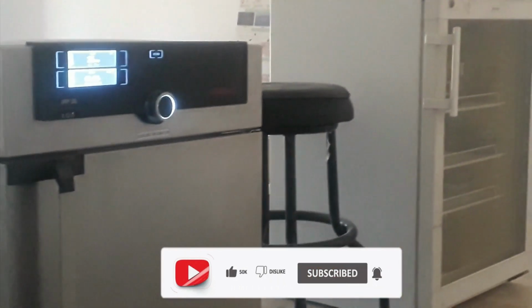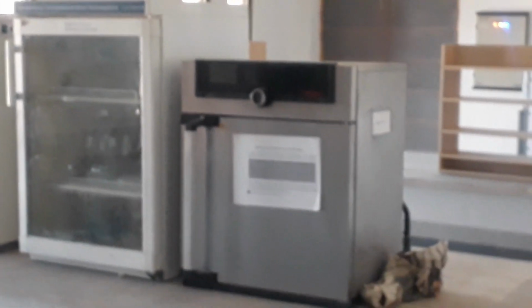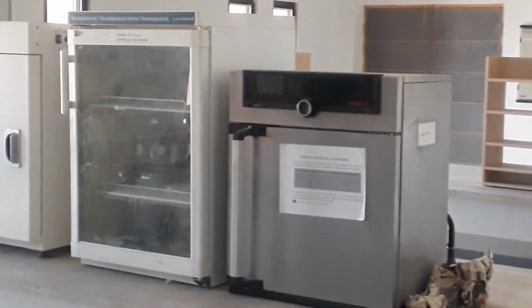They are commonly used in microbiology, cell culture, and molecular biology studies. Incubators help maintain a stable and optimal environment for the samples, ensuring accurate and reliable results.